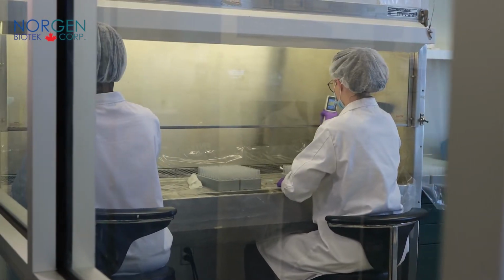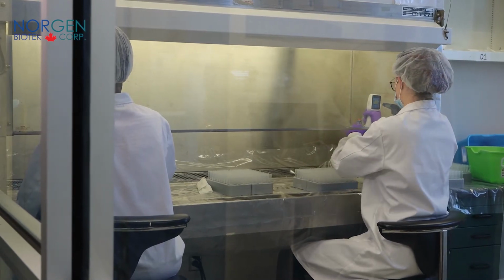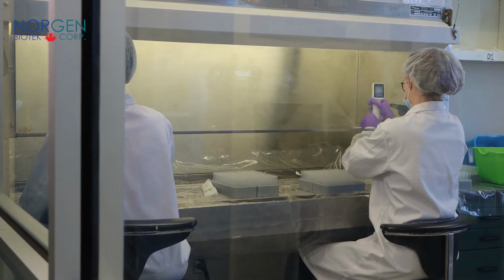In around January and February, when we started hearing about the virus and the potential threat that it had coming to North America, we started to focus our R&D efforts on developing products specific to detecting COVID-19, as well as enhancing some of our products to better suit the COVID-19 workflow. We've been able to go from just a couple 100,000 test kits per week to now closer to 1 million by bringing in instruments that allow us to produce more at a time, more consistently.